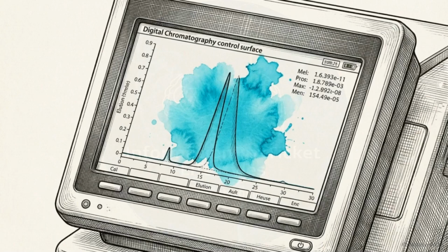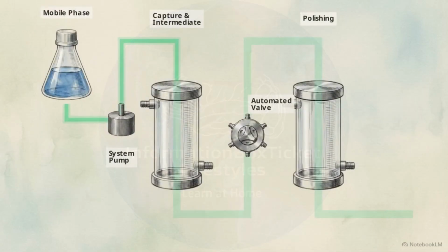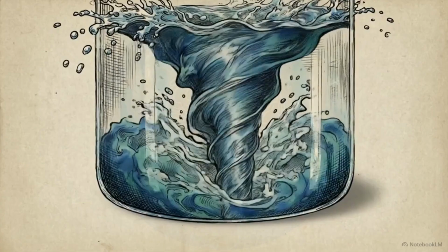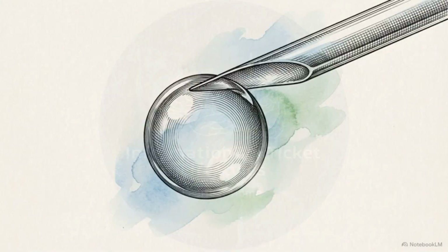Recent hardware innovations are actively reducing those logistical costs. Miniaturized systems now save on expensive materials, while multi-column automated setups merge the purification steps into single continuous runs. Meanwhile, advanced UV detectors built with nanomaterials track the eluting molecules with intense precision. The system acts as a strict mediator in the laboratory. It negotiates the delicate balance between the harsh forces of fluid dynamics and the fragile complexity of biology, turning chaotic mixtures into pure, life-saving clarity.